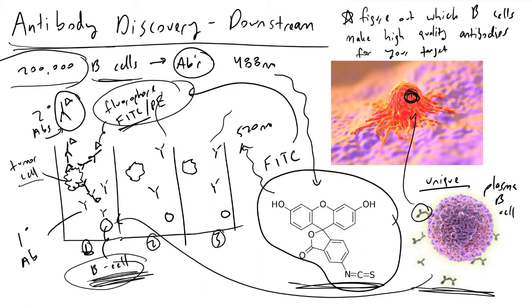And what we'll recognize about this is that 488 nanometers corresponds to what you will perceive as blue light, and 520 nanometers will be perceived by you as green light. And so if we have a high concentration of FITC fluorophores inside one of our pens, they will be absorbing tons of blue light and they will be emitting green light.